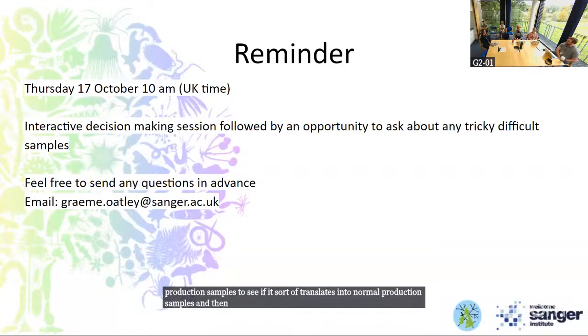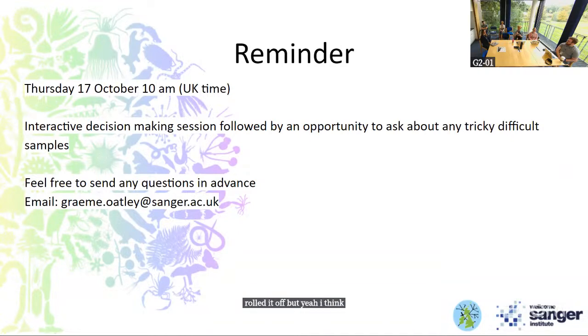But yeah, I think figuring out what the problem is you need to solve is the first thing, and then seeing if we can develop a good experimental design to test if we can fix that problem. Then yeah, having the right samples to try it on as well.